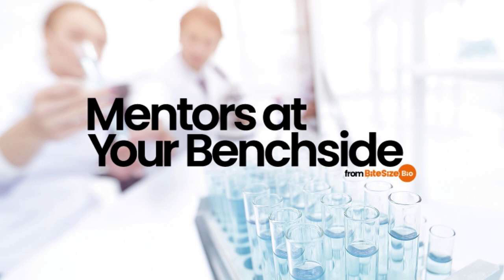Increased autofluorescence is something to be wary of with all fixatives, and it can be particularly problematic if the target of interest is expressed only weakly. Fixation may also change the light scattering properties of the cells, which may be important to you.